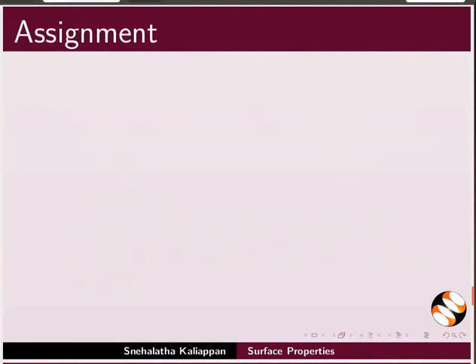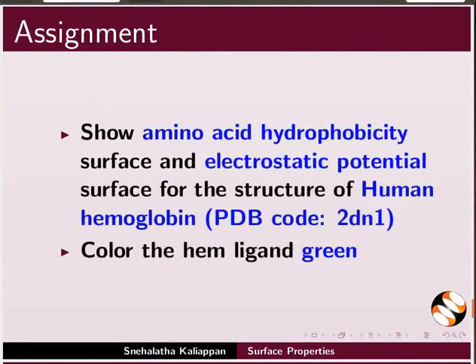Now, for the assignment, show amino acid hydrophobicity surface and electrostatic potential surface for the structure of human hemoglobin, PDB code 2DN1. Color the heme ligand green. Your completed assignment should look as follows.